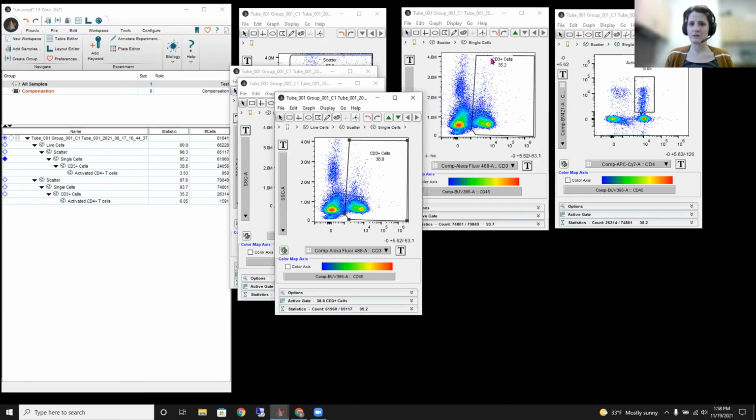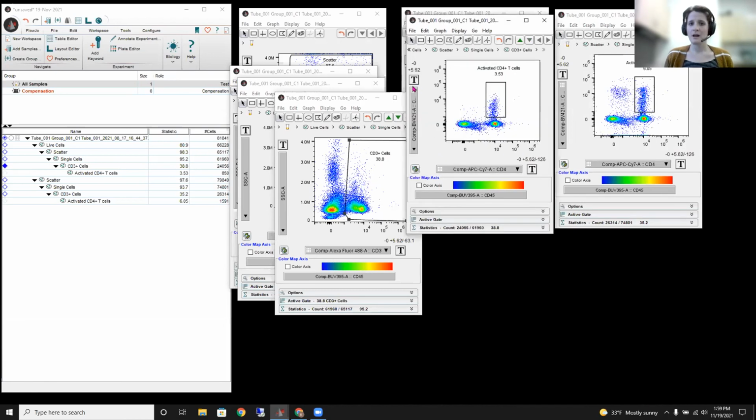And what I'd also like to note is that it might be a little hard to tell, but there are potentially, without doing a deep analysis, a little bit more cells showing up higher in side scatter here for the CD3 positive when we haven't excluded our dead cells. Okay. From there, I'm going to double click on that population. And here, when we're looking at our CD25 positive, CD4 positive T cells, what do we see?